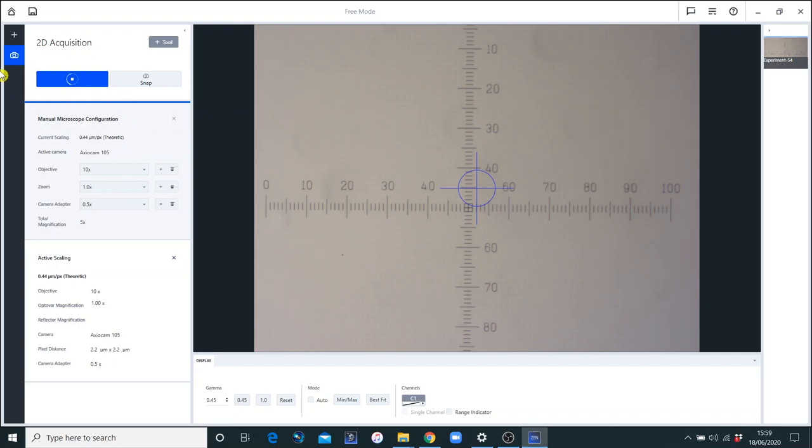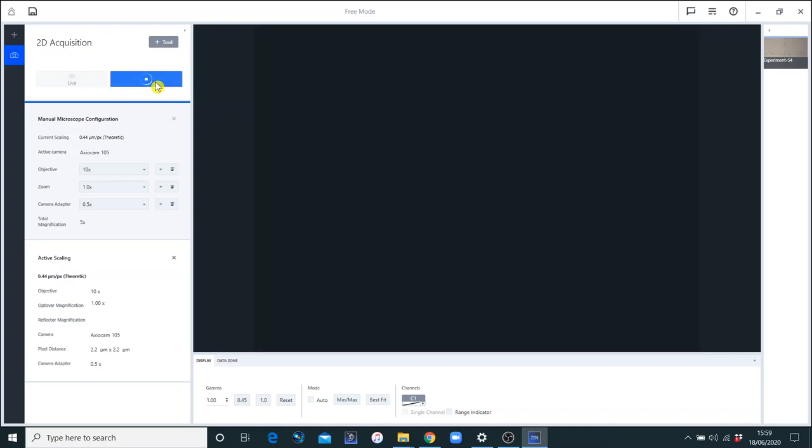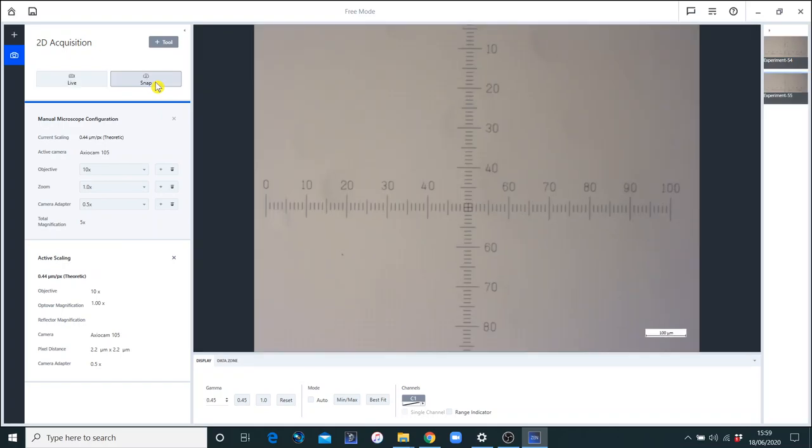Many customers would find that okay just to get a rough measurement. But if you want a traceable measurement or a calibration, then we need to actually measure this scale and work out how big the pixels are. So I'm going to need to add another workbench. The first thing I'm going to do here is set the objective to 10 and snap the picture. That gives me a picture which I can then use for calibration.